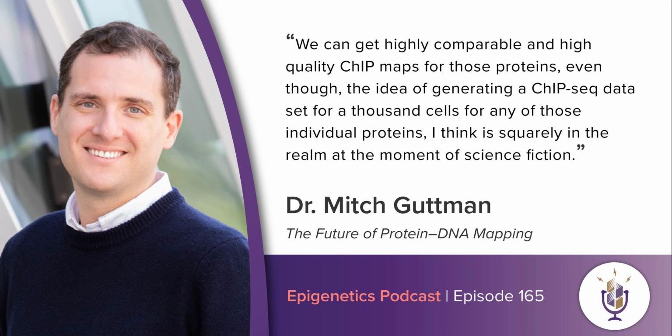Maybe we can come back to the analysis part later, because I want to come back to the cell number question. Sure. So maybe people in the beginning won't do like 100 antibodies, but maybe 20 to 30. And maybe you can comment on what range of cell number they would need in that case. And also, what are the limits when you look at sample types? I mean, we are talking about cell lines in this case, but is it also applicable to tissue or cancer samples where you would have really limited amounts? Right. Yeah.